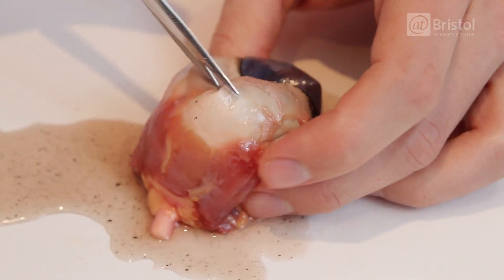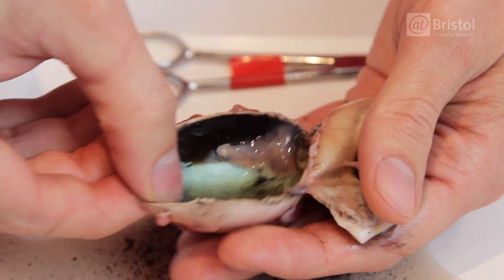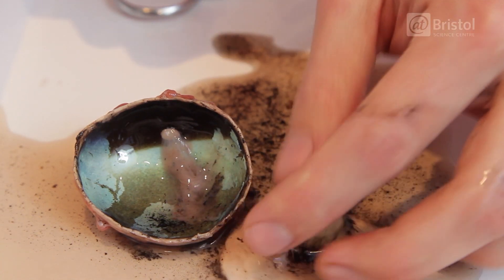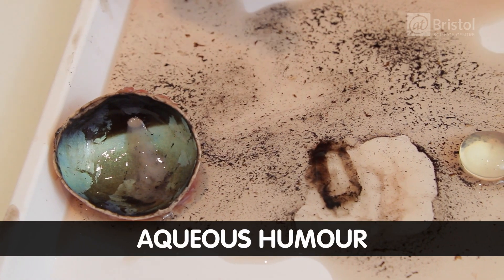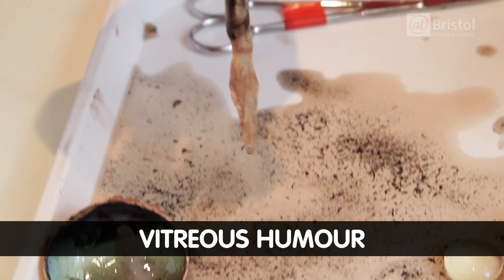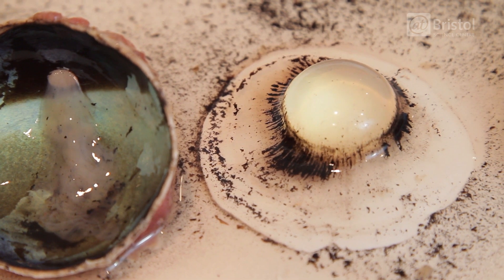As I cut around the circumference of the eye to separate the front from the back and take a look at what's on the inside. Here we can see two liquids which have come out of the inside of the eye. This runnier liquid is called the aqueous humor, and this jelly-like substance is called the vitreous humor.